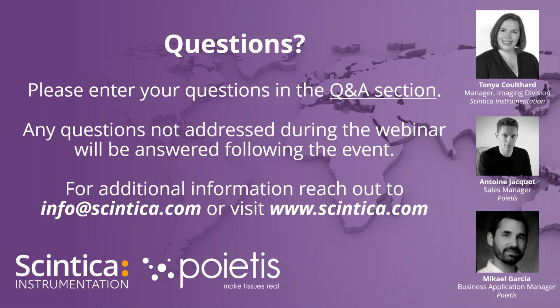Now, maybe that person is worried about precision. So this is what I would like to add. Before you distribute cell droplets, you can really zoom in the picture to a maximum. We didn't show it, but with the microscope, that's the beauty of having a microscope. You can really zoom into a few microns, and so the spot that you will select will be with very high precision.